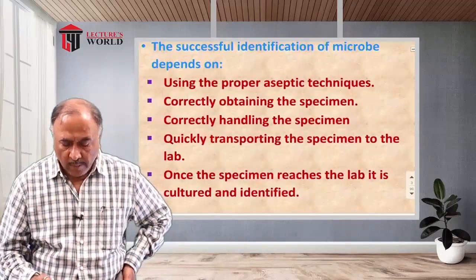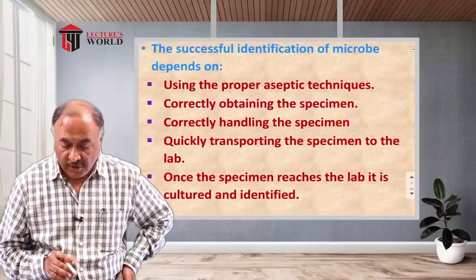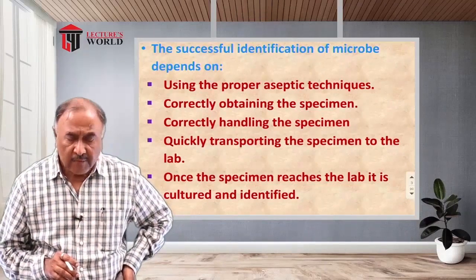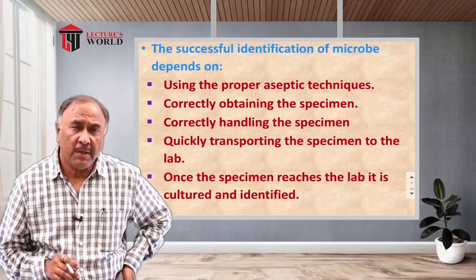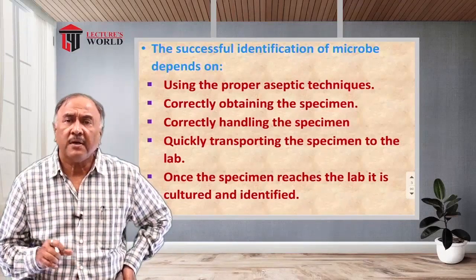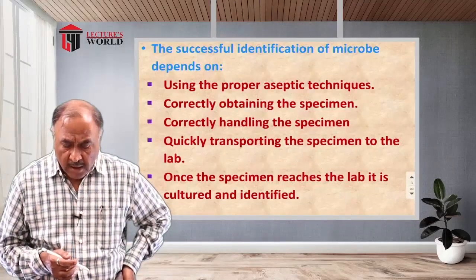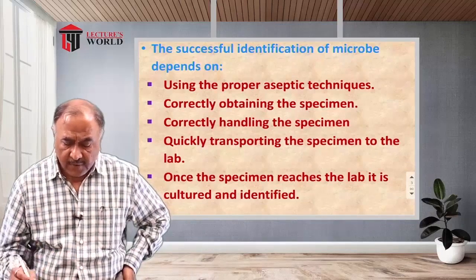Now, the successful identification of a microbe depends on various factors. There are so many factors which would interfere with the techniques of identification that we are going to study. But some of the major points include the following.